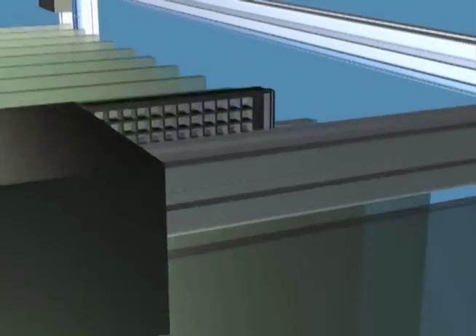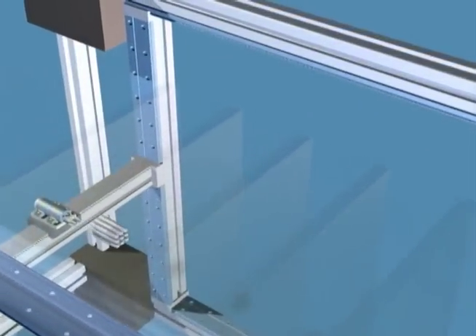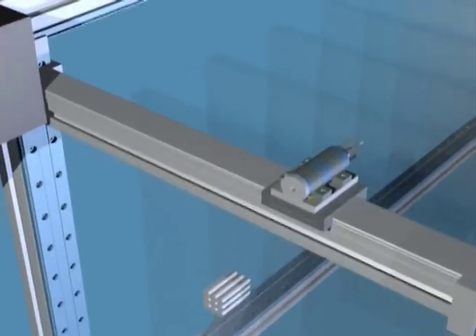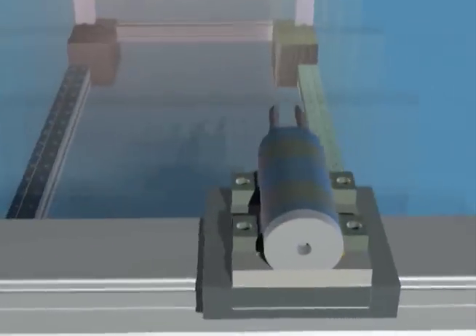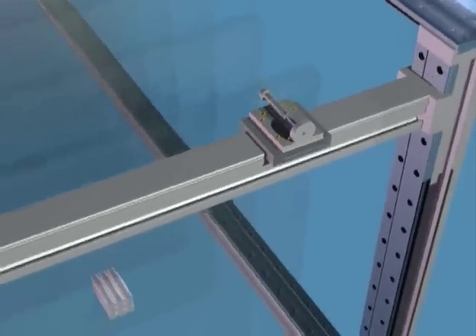The CBSR is currently developing an in-freezer robot for further sample storage automation. This robot uses a unique single cable system to reduce weight and cost while increasing speed.